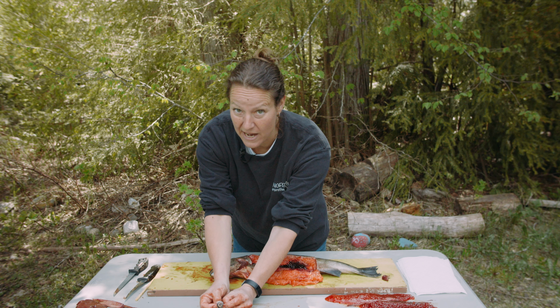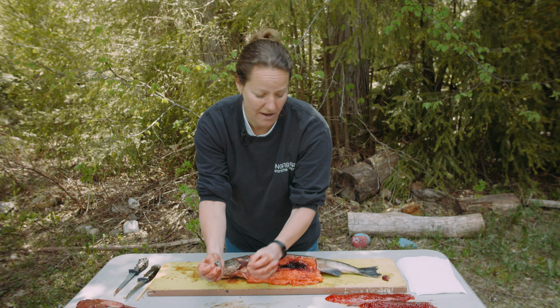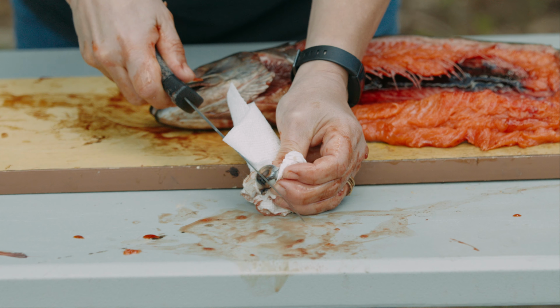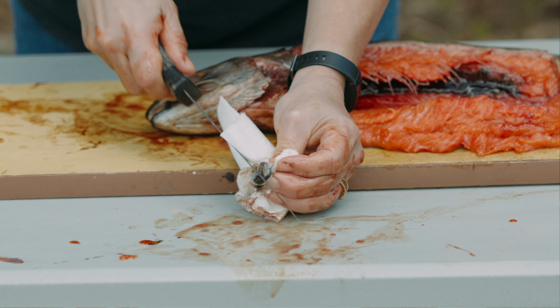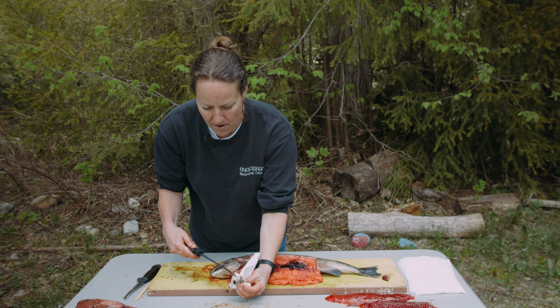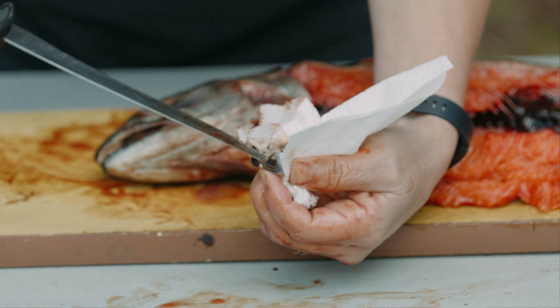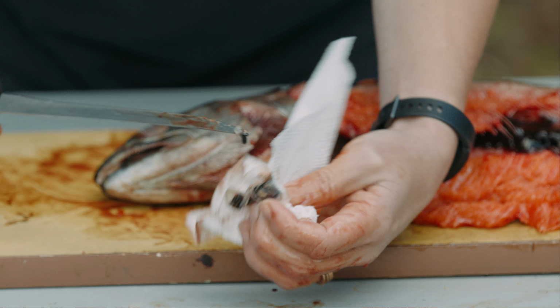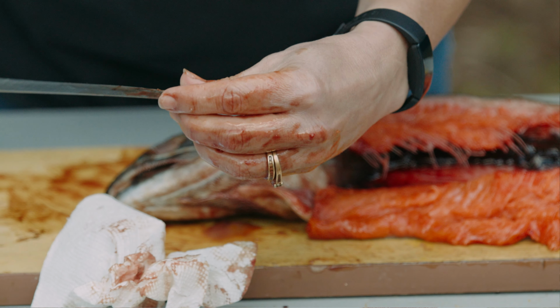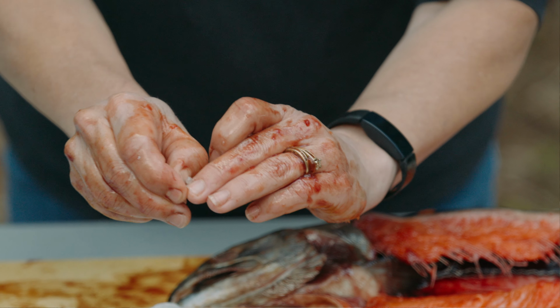Okay, but first I have to wipe this eyeball off because it is very slippery. So here we go. Let's see if we can get into this eyeball. Oh, see the squirt? See all that fluid come out? Okay, now we have it open. And let's see if we can get the lens out of here. Oh, the outer lens has popped, but we still have the inner lens.